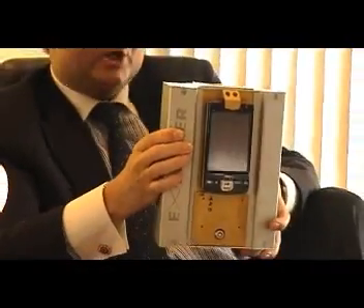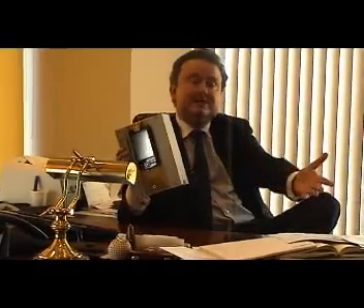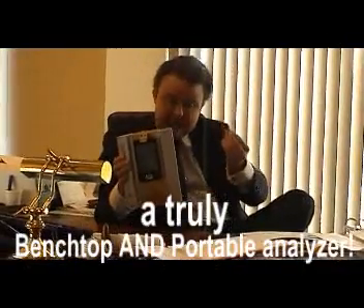Why is it a benchtop analyzer? Because you can easily use it in a laboratory. You just place it on your benchtop, and you can use it either with your PDA or connect through USB to your computer with more extended software on it. So it's a truly benchtop and portable analyzer.